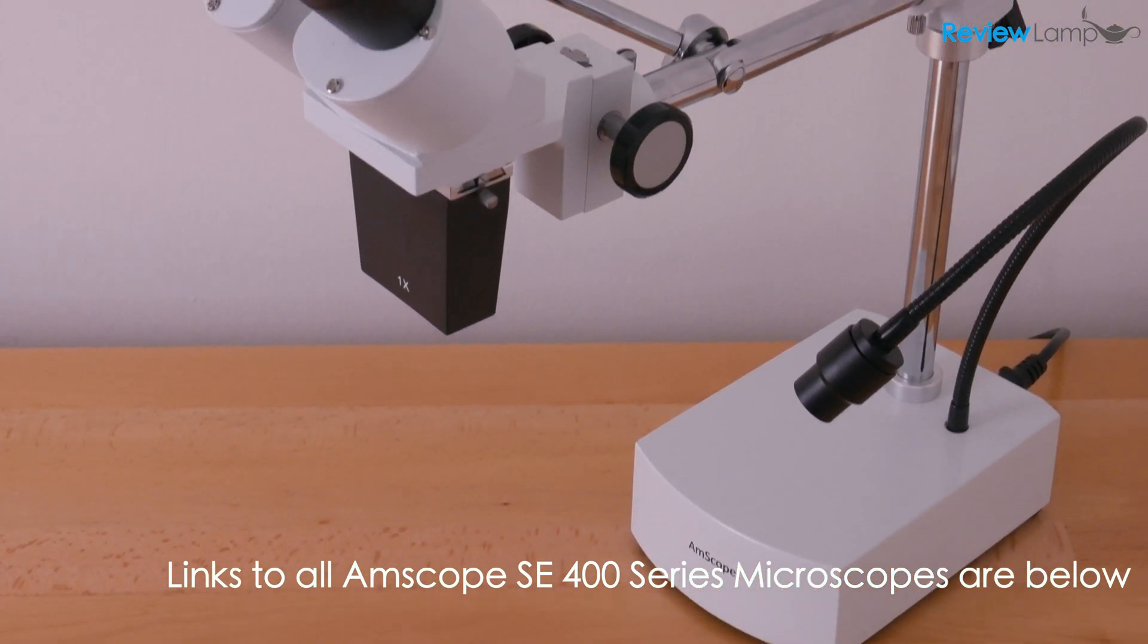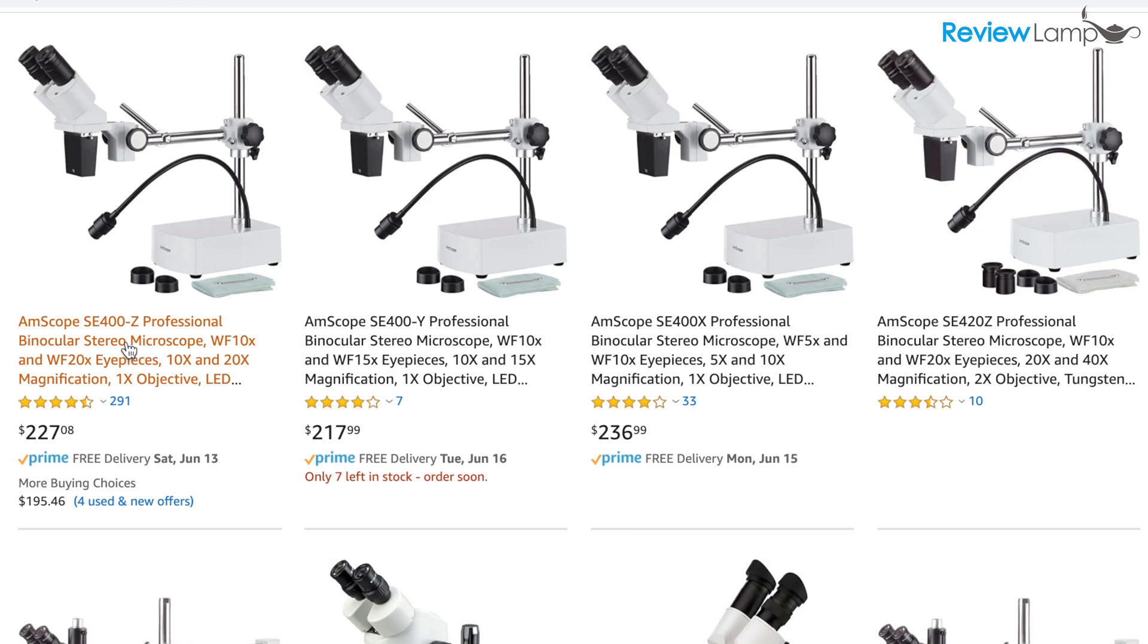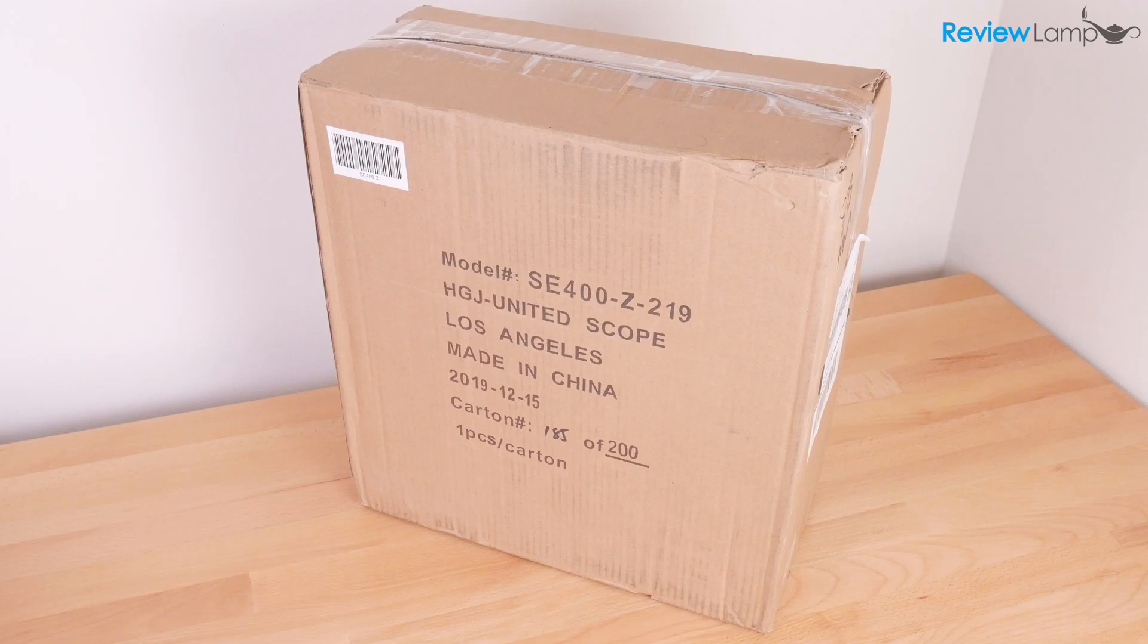Now, the assembly procedure is exactly the same whether you buy an SE400X, Y, or Z. The only critical difference between these three microscopes is the eyepiece magnification. So what I'm going to do is get all the parts out of the box, lay it out, and then we're going to start assembling it.